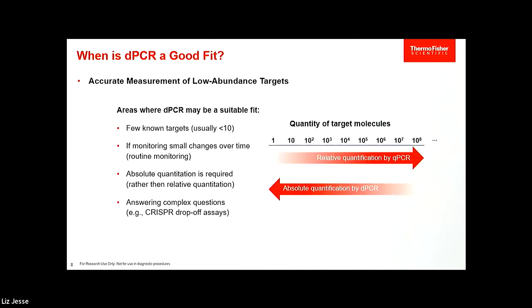It's perfect if you have a few known targets you want to identify, if you're trying to monitor very small fold changes over time. And it's also good for answering some complex questions, which I will address a little bit later.